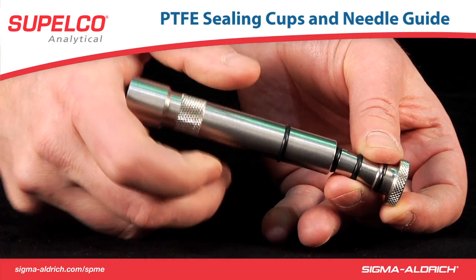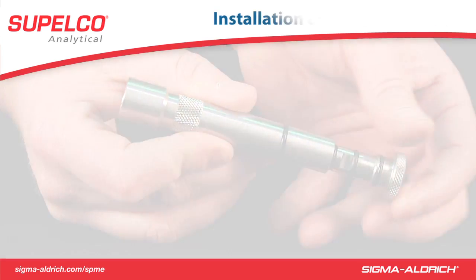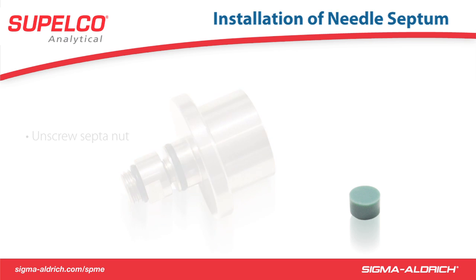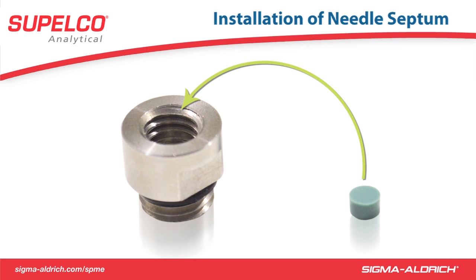To prevent contamination of the inside of the holder, the FFA's needle is sealed by a septum in the holder. The septum is installed by first unscrewing the septum nut. Next, insert the silicone septum, and finally reinstall the nut to the holder.